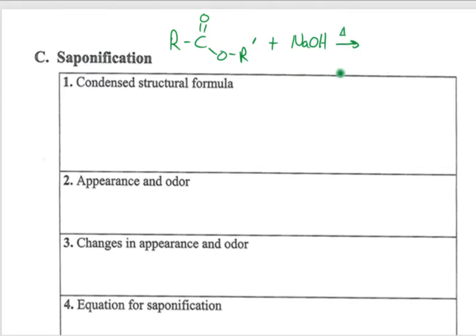Now, actually in the video, you're not going to see the heating part because it's just a clear and colorless solution going to another clear and colorless solution. The video that you'll see here in a minute is what happens at the tail end of the reaction. And I'll get to that in a minute. Now this base, what it does is it breaks the ester. You can imagine it breaks right there.